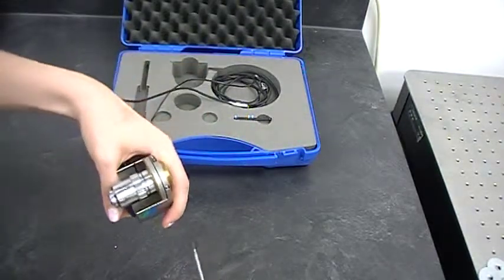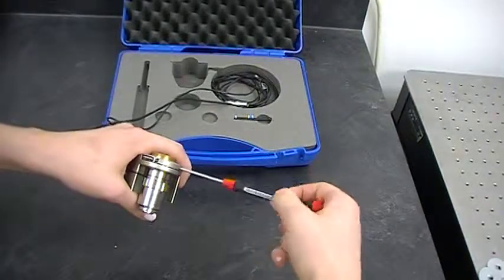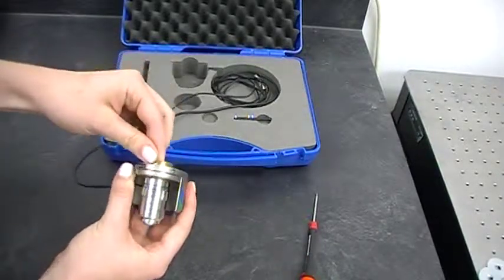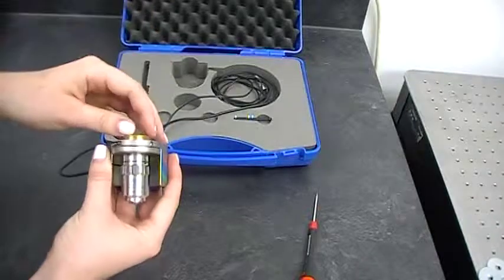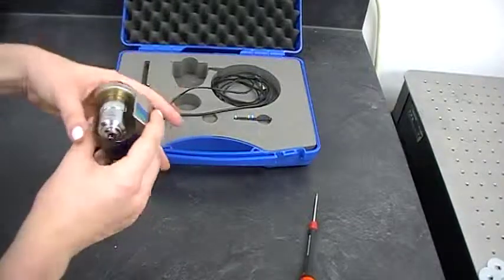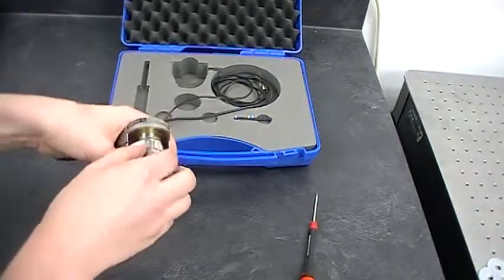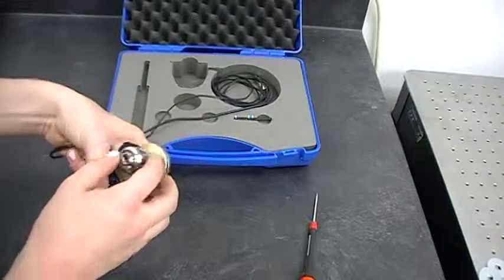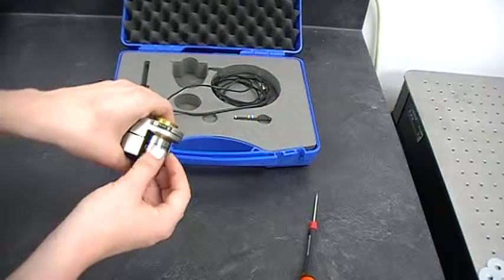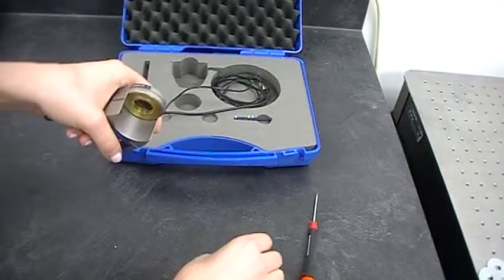You just screw that in and tighten it a little bit. You can see pulling on this and it's not coming apart — it's holding the whole system. When you're ready to take your objective out and put something else in, just do the same thing in reverse — just unscrewing. And you're done.